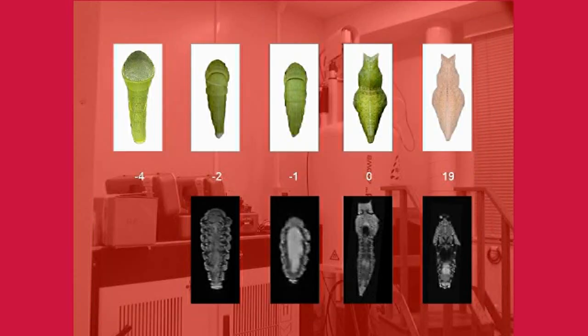The reason why this structure is not seen in the images immediately after becoming a prepupa or pupa is that the testis of the butterfly is divided into the left and right sides of the body during the larval stage, but after pupation, it moves closer to the median plane. It is thought that it becomes possible to confirm it in the figure of the median line because it is integrated.